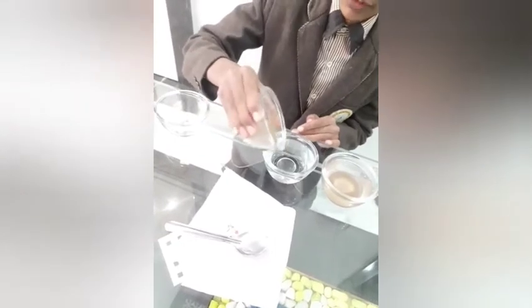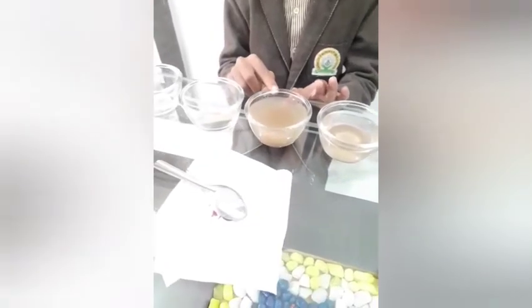First we add some soil in clean water. We see the soil is settled down. This is sedimentation and clean water floats on top.